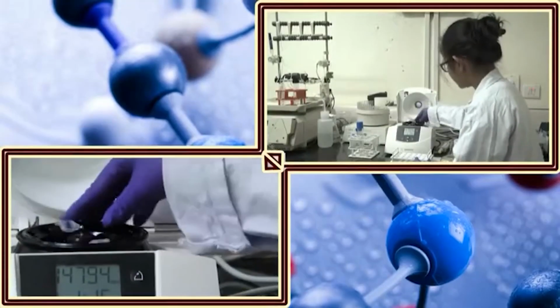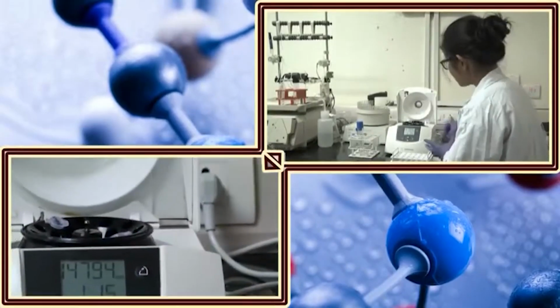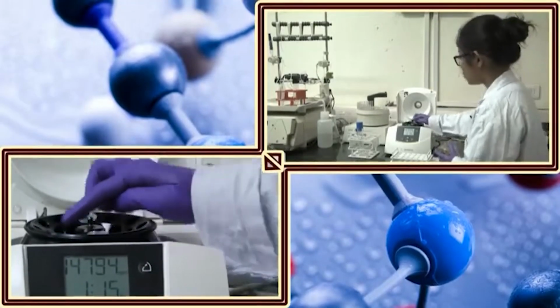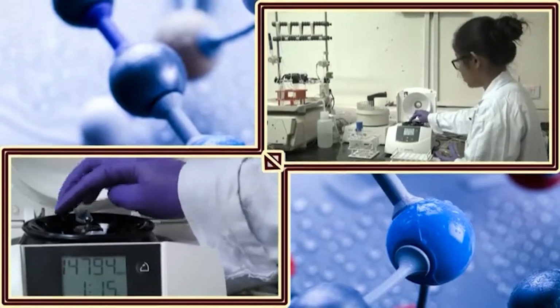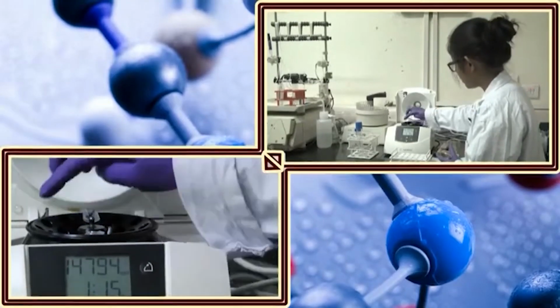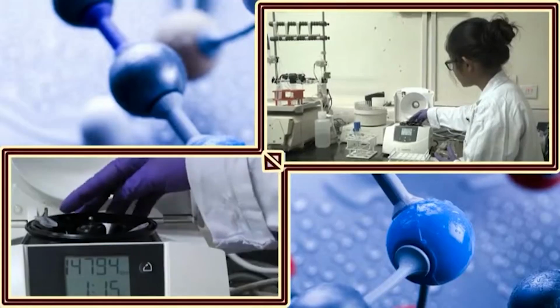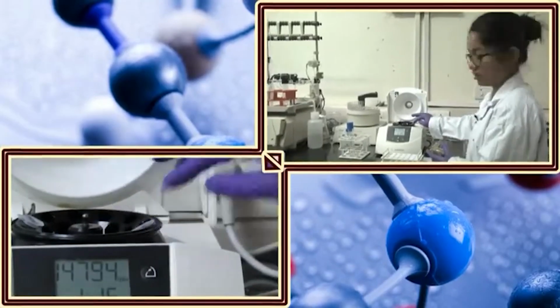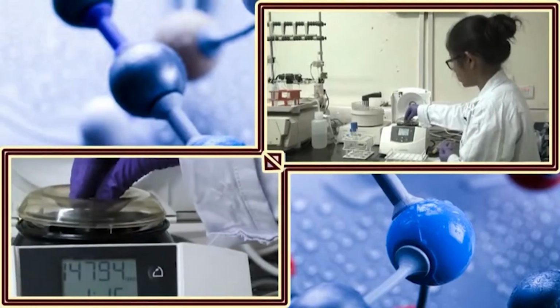Put it at the opposite side. If you feel like you do not know exactly which one is the opposite side, you should count the blank holes in the rotor. So, from here there is 1, 2, 3, 4 and 5. Again from this side it is 1, 2, 3, 4 and 5. So, that means it is equally distant. So, it is at the exactly opposite side.